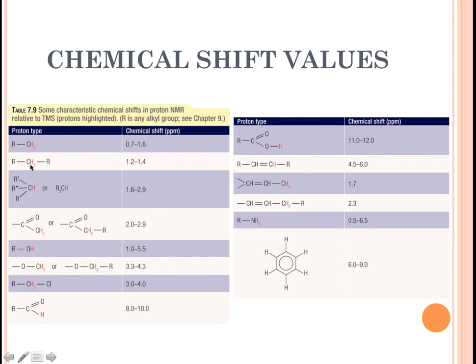And remember, R means we've just got a hydrocarbon chain on either side. If we start adding in oxygens, but they're a little bit farther away, then we get an increased chemical shift. The closer those oxygens get, the higher it gets. And if we start adding a couple of oxygens, then we're getting a very high chemical shift, because that means this poor little hydrogen's got almost no electrons around it, so almost no shielding, so it's having to deal with the full force of that magnetic field.